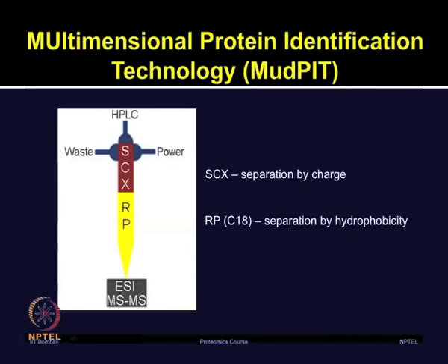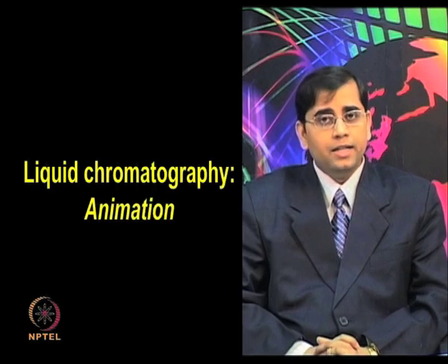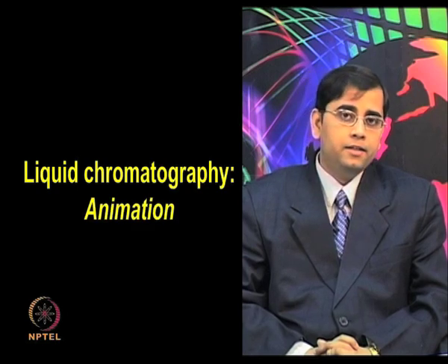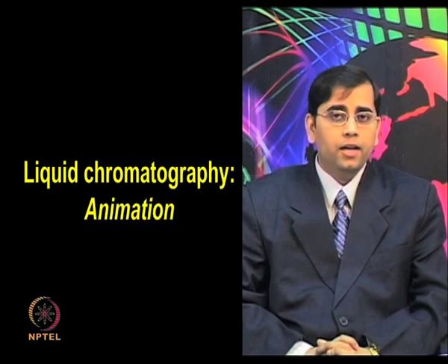In this technique, the strong cation exchange separates by the charge, which provides low resolution fractionation in the beginning, and then the reverse phase C18 column separates peptides based on hydrophobicity, and it provides a high resolution gradient. Let me describe some of the concepts involved in liquid chromatography in the following animation. I will also discuss MudPIT and some of the chip based approaches which are integrated for proteomic application with liquid chromatography. So, let us discuss these concepts in the following animation.